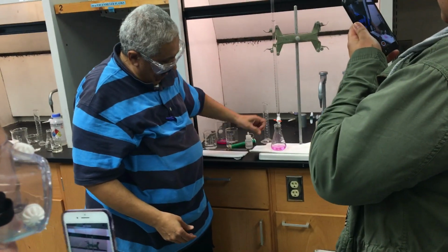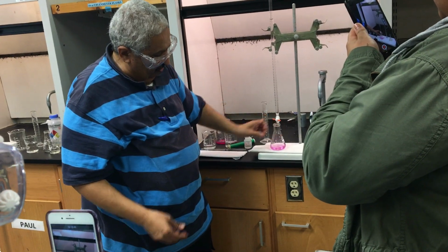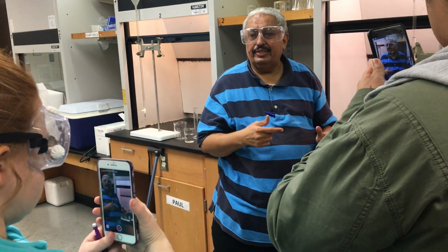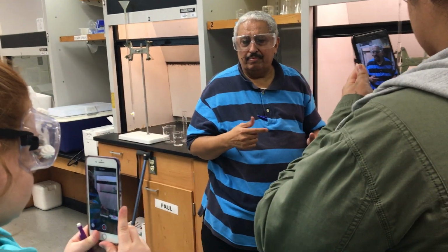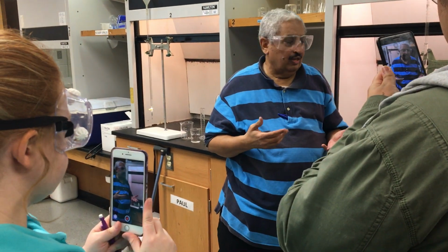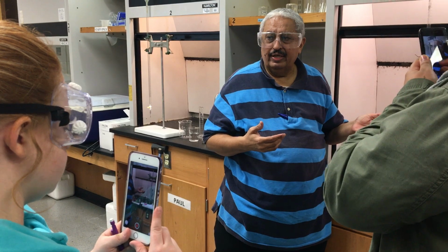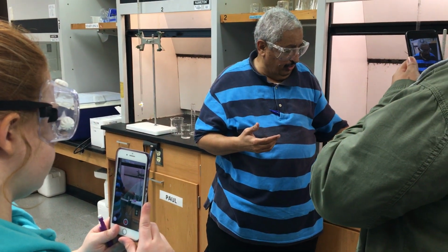Can you see it, guys? 17.25. This is my titration value, which I have to use to calculate the number of moles and then calculate the molarity of acetic acid. Everybody's following? Now, any question you have?